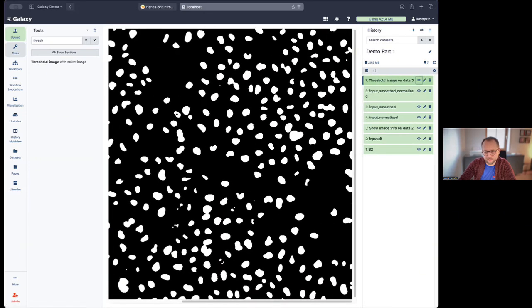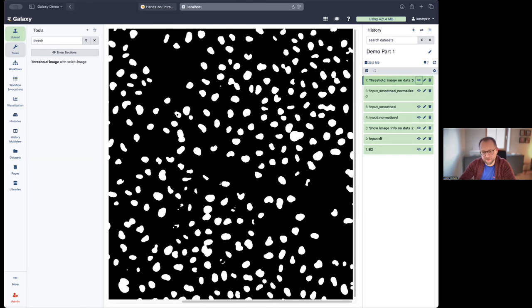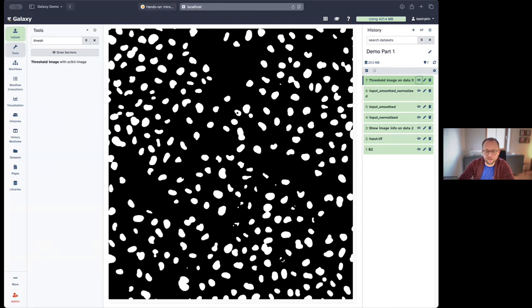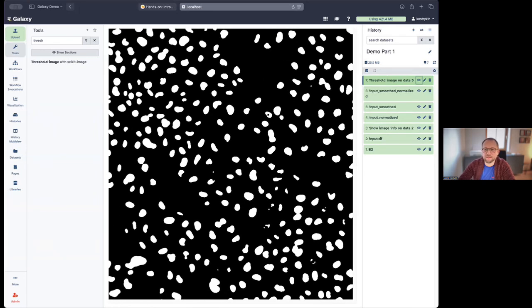And this is what the result image looks like. So here we have black image pixels, which correspond to the image background, and white image pixels, which correspond to the image foreground. However, we also want to perform object counting and not just segmentation. And this means that we need to identify the individual objects and not just the image foreground.